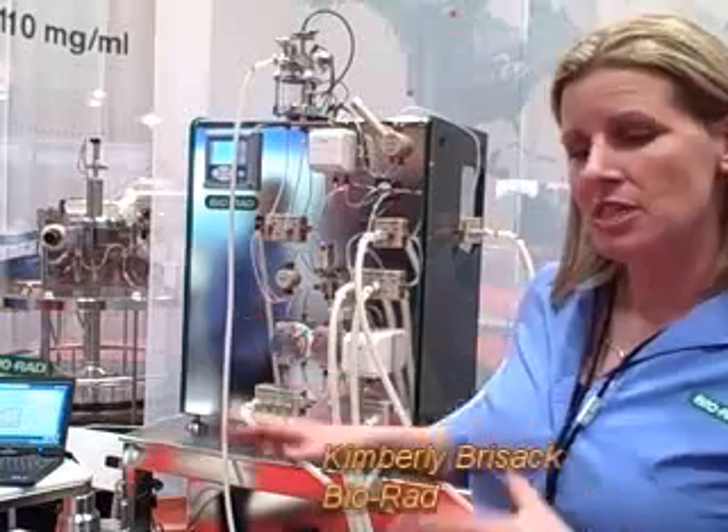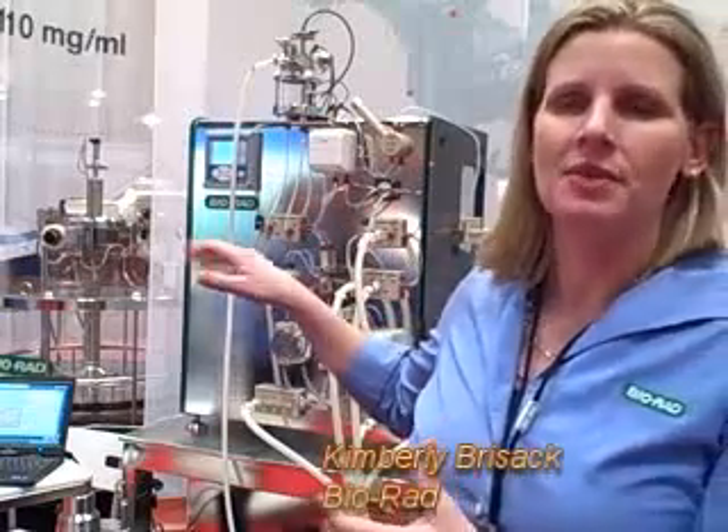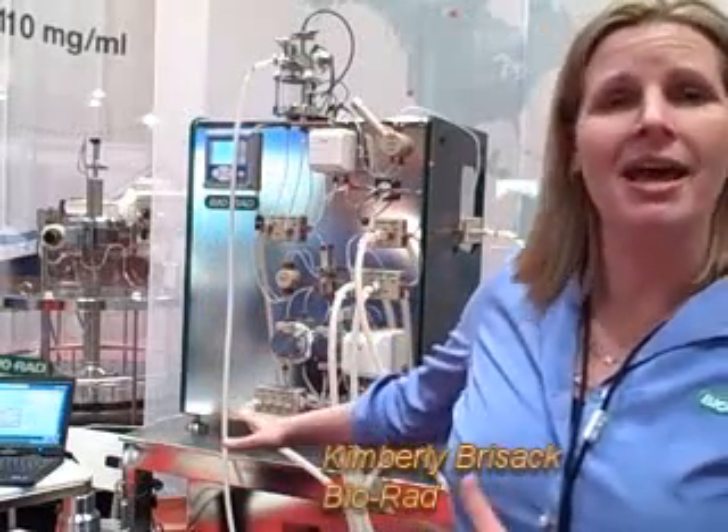It goes 2 liters a minute, which is about twice as fast as other comparable systems of the same size. Since we were able to put this skid on a bench top, we decided to manufacture a bench. In that bench, we put a couple of pumps — one for transferring slurry in and out of the column, and one for cleaning the column. We also have an in-place column with slurry valves that can bring the slurry in and out without having to take the top off.